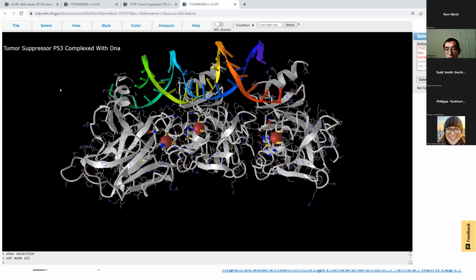let's just do 2 minutes of playing around, and then I'm running short on time, so I want to show a mutation analysis, at least one of the examples really quick, and then point you to educational materials.